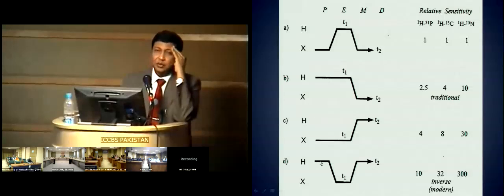The XY plane is split into two. During a particular time frame, it goes to the antiphase, right? Then you give a 90 pulse to bring it to the Z and negative Z, right? You transfer polarization to the carbon. And that is a position in which carbon and proton both are on Z and negative Z.